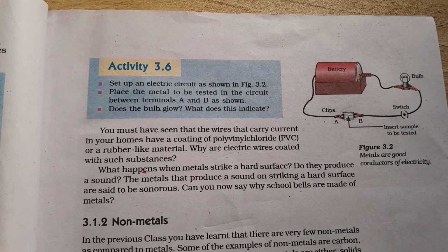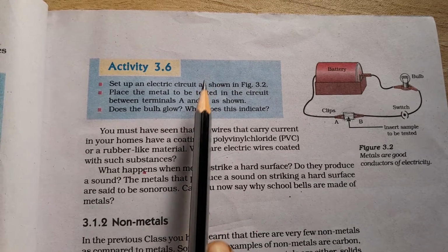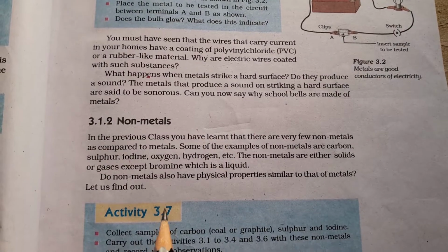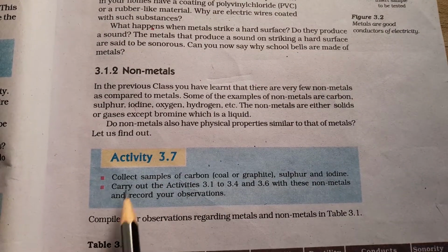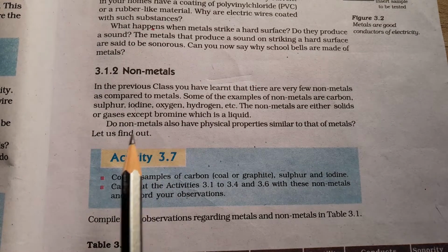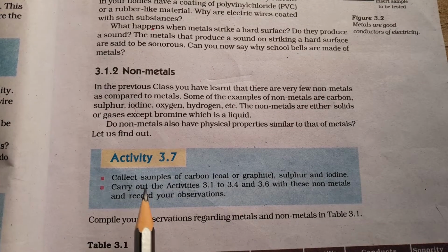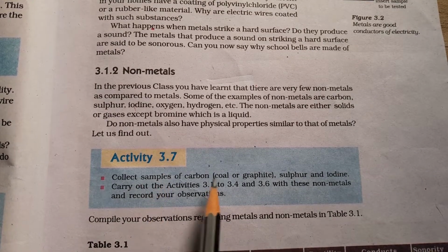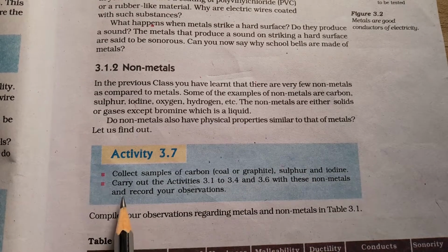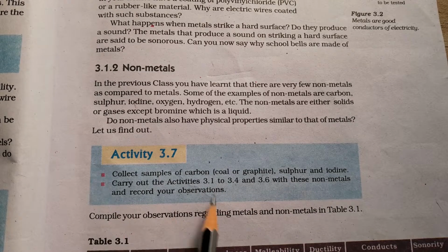Next activity. So from this activity 3.6 we have concluded that metals are good conductors of electricity. Next, activity 3.7: these are all non-metals. So far we have been talking about the activities with metals, and this is non-metals. Collect samples of carbon, which may be either coal or graphite, sulfur and iodine. Carry out activities 3.1 to 3.4 and 3.6 with these non-metals and record your observation.